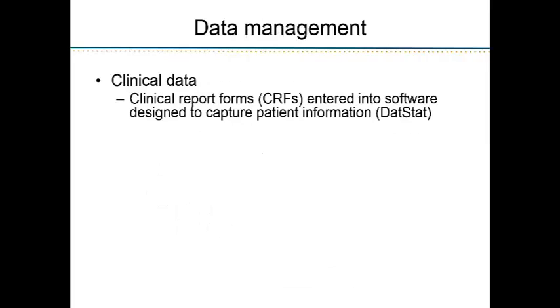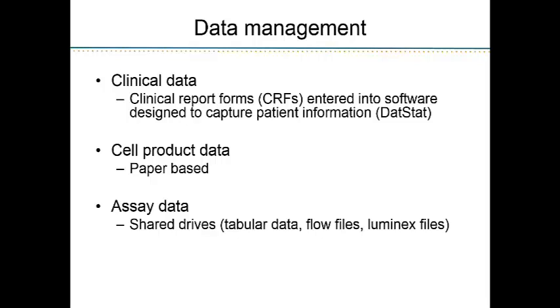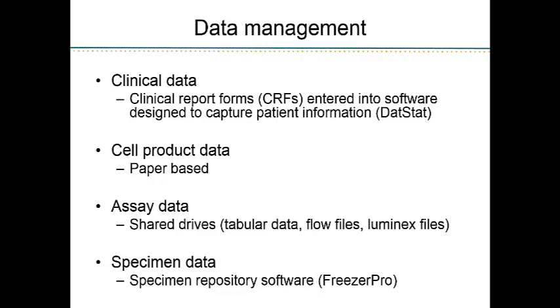The clinical data is in the form of clinical report forms, and they enter all of that data into DataStat, which is a software designed to contain patient information. The cell product data from the cell production core and even some from our lab is entirely paper-based. The assay data that we collect is typically on shared drives. We have Excel files, flow files, luminex files, and we also manage our specimens on FreezerPro, which I won't be talking about today since we haven't really done anything with that in LabKey so far.